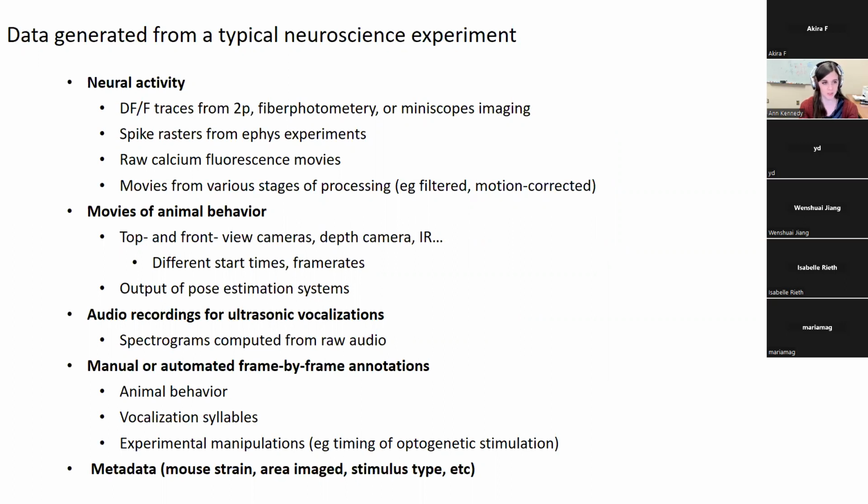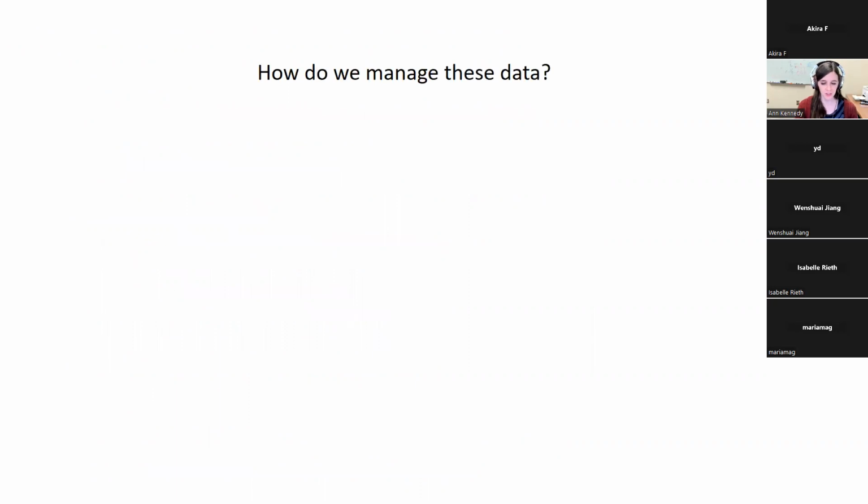One of the big issues with analyzing neural activity from freely behaving animals is you can only really analyze what you've annotated for. If you have manual scoring of some behavior, you can look at neural responses to that behavior. But it could be that neurons are responding to something else that your animal is doing that you didn't think to annotate for. And unless you see neural activity and behavior side by side, it's really tough to find those kinds of correlations.